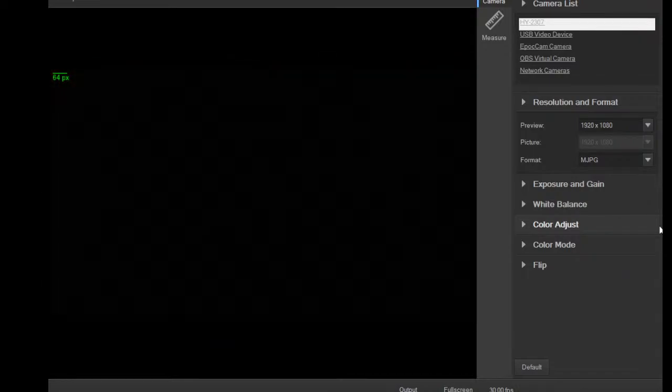So I got a little ciliate here. Let me go a little closer. It hasn't moved for a bit, so I could probably zoom in on it. There it is, little guy. This is a very common one I see around here. I have a bunch of videos of this kind of guy expiring on the slide. You can actually see some older streams where they sit there, stop moving after a while, and then through osmosis, when active transport stops working, they basically explode from water pressure.